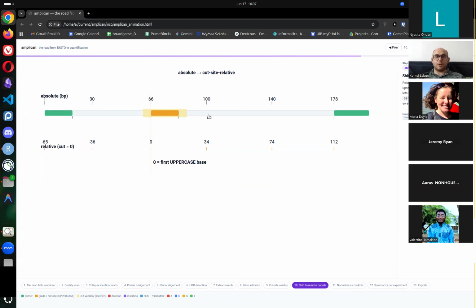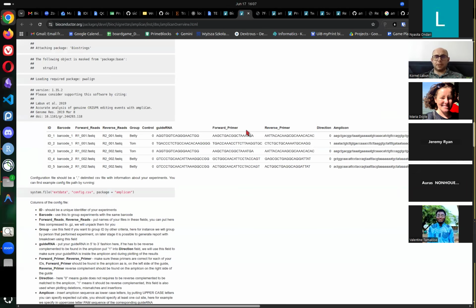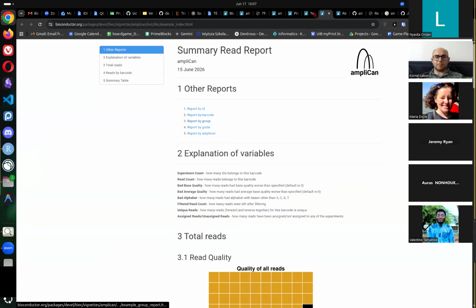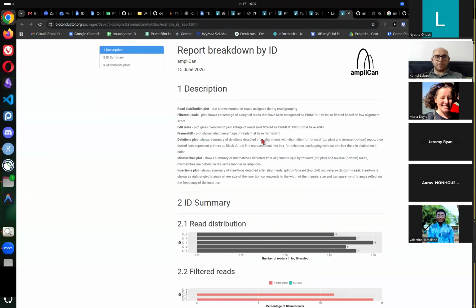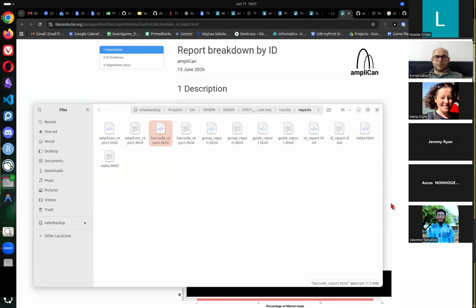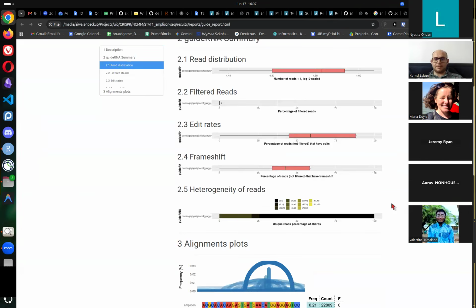Let me show you on some report. We had here reports, and we can open the one by guide. Maybe we'll open the real one from here. Guide report. We are running low on time, I see. I was not prepared.